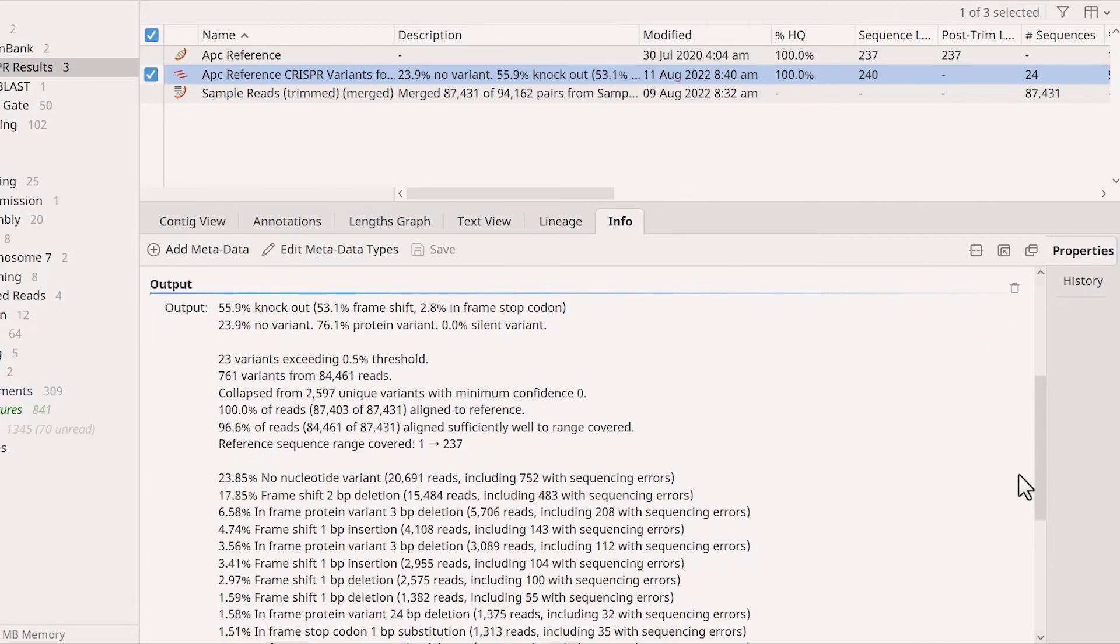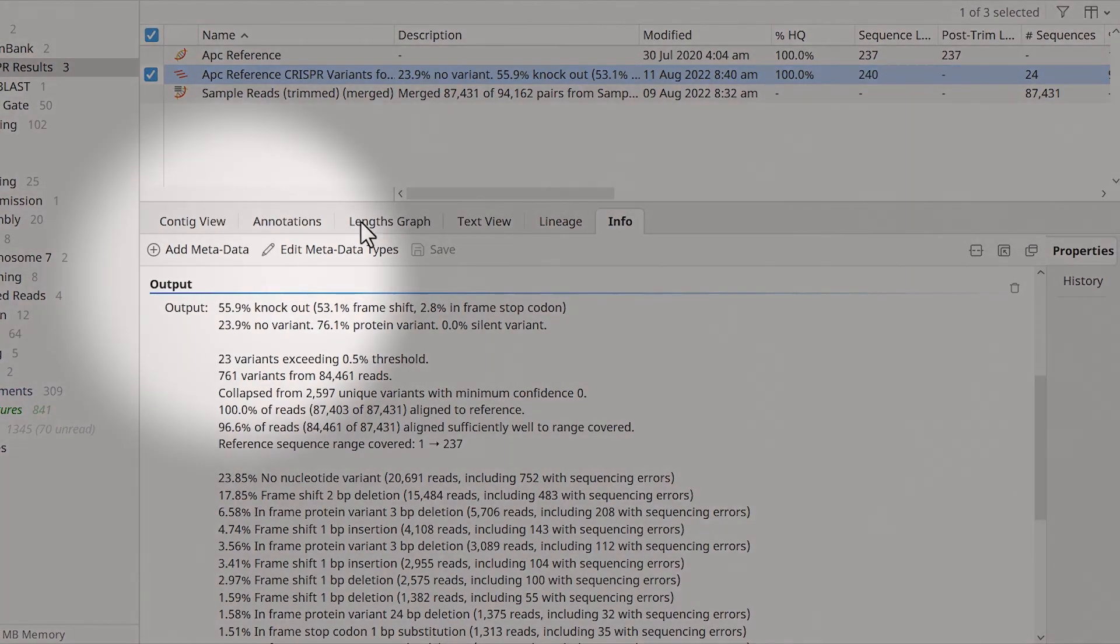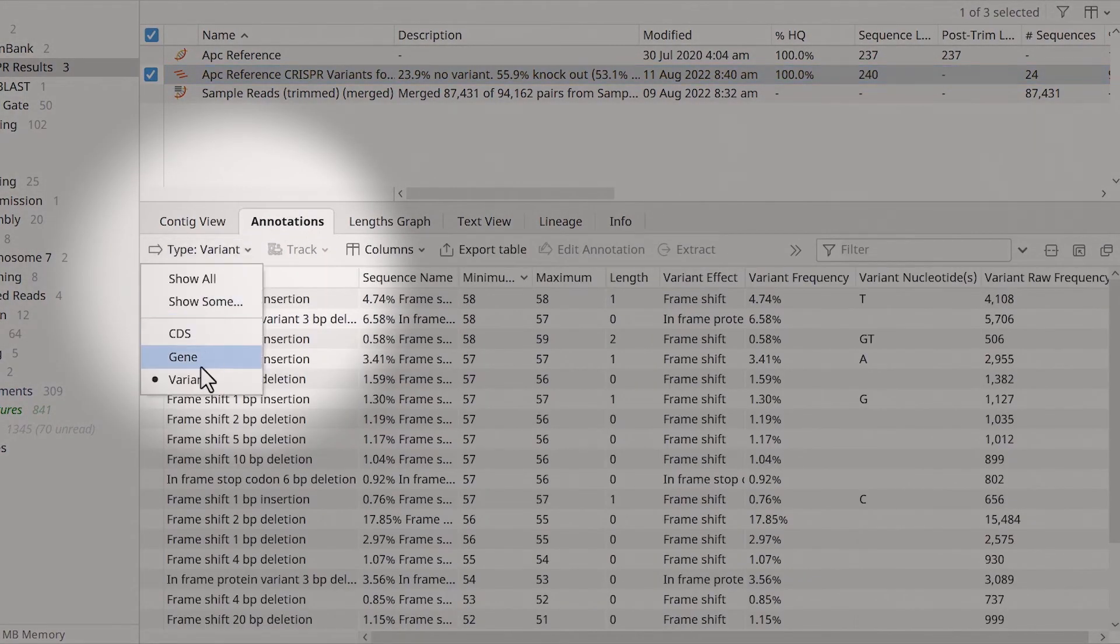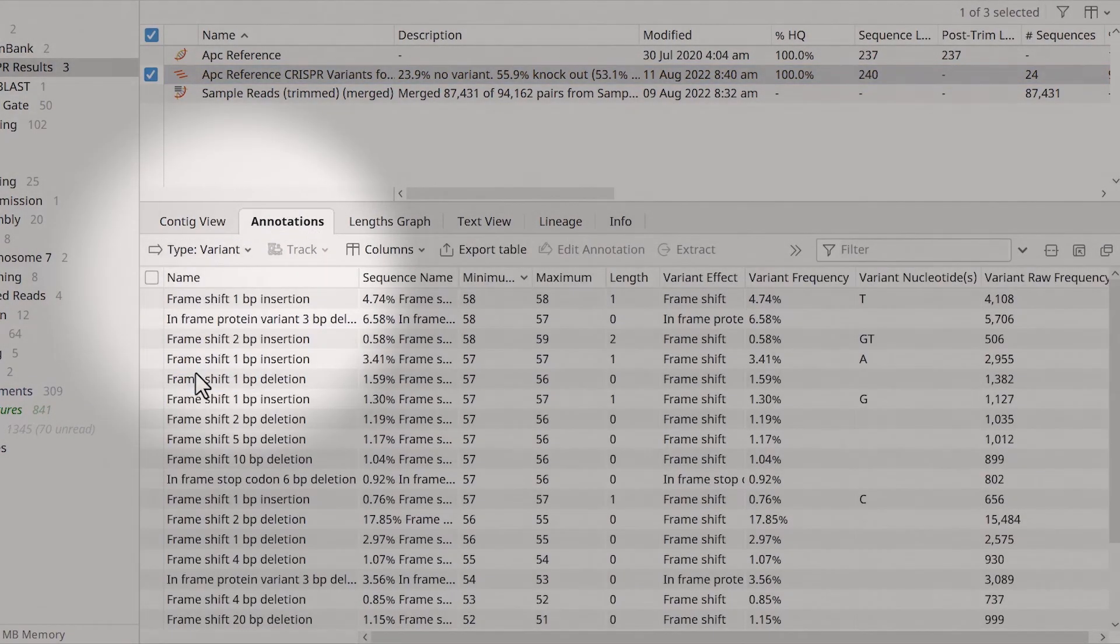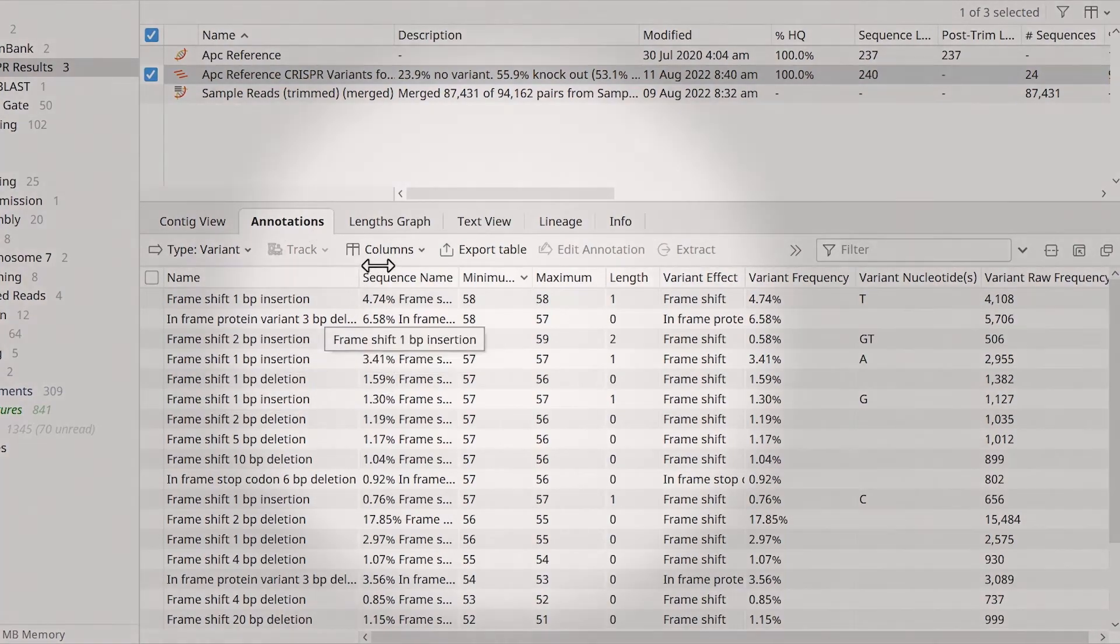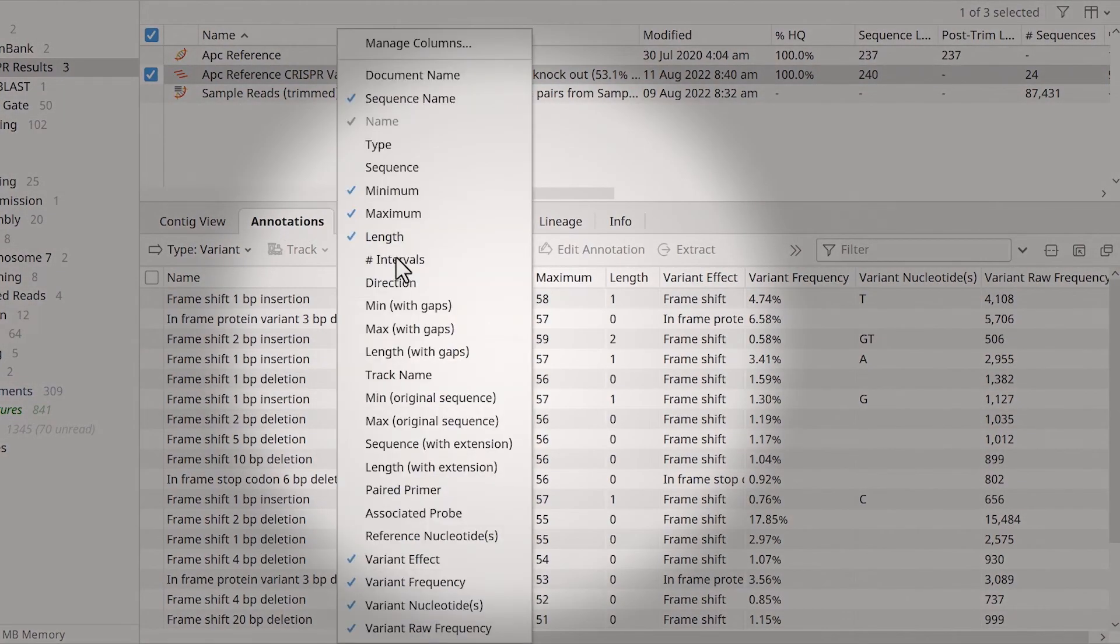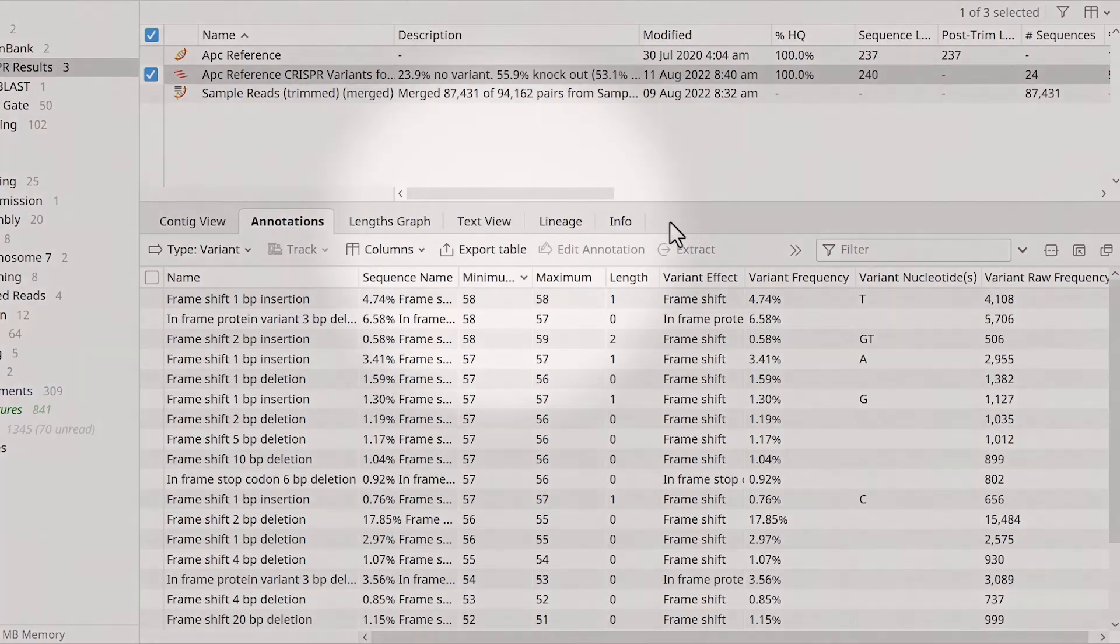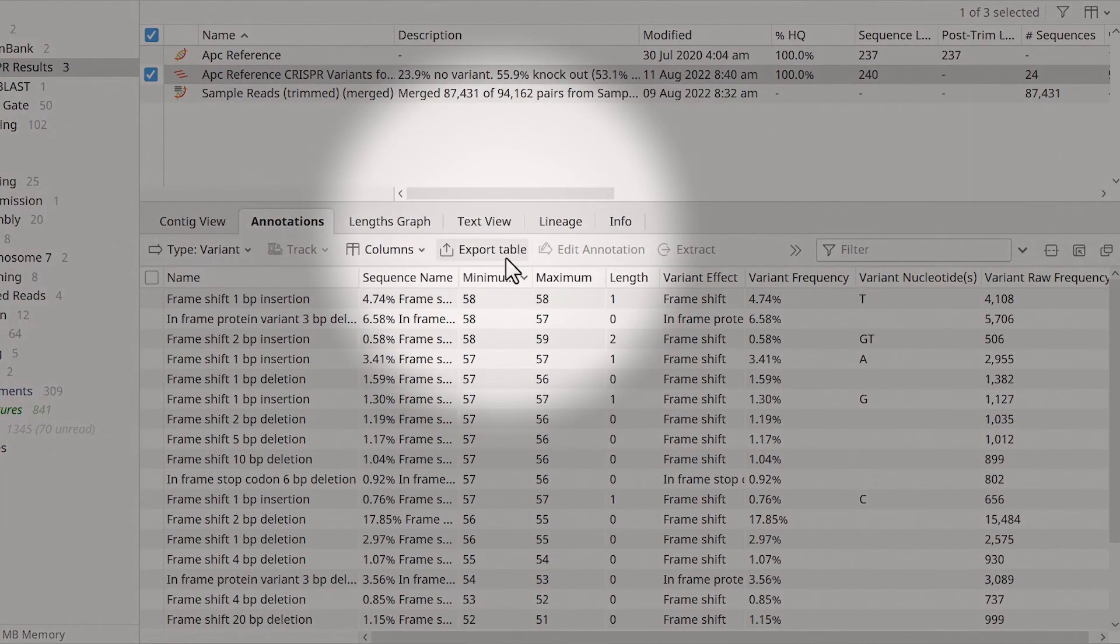To view the results in tabular format, switch to the Annotations tab and select the variant type. You can use the columns drop-down menu to adjust the data shown in the table, or export the Annotations table as a CSV file by selecting Export Table.